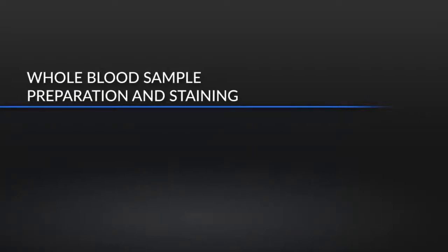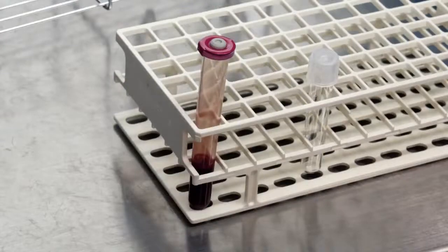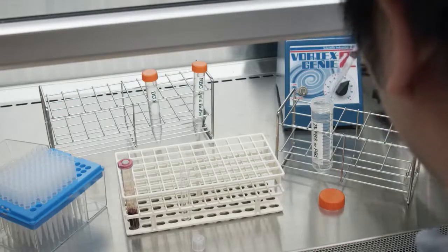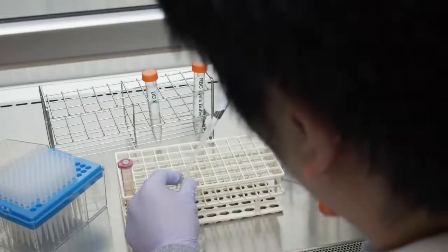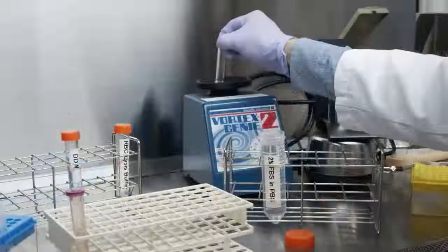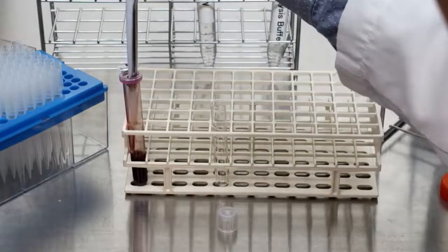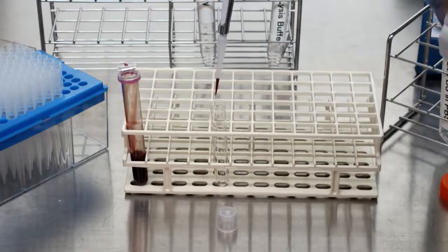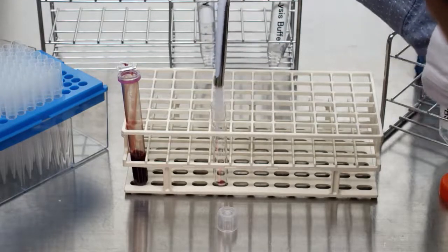To begin, collect whole blood samples into blood collection tubes containing EDTA. Treat each 5 ml round-bottom polystyrene flow cytometry tube with 1 ml of 2% fetal bovine serum in PBS. Vortex for 10 seconds. Then transfer 20 microliters of whole blood samples to the treated 5 ml round-bottom tubes.